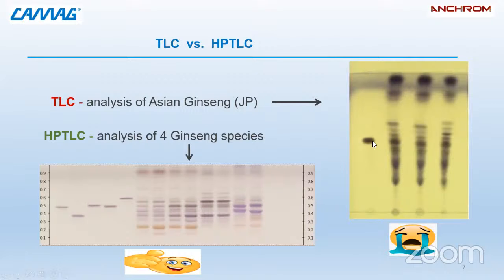Now, if I ask you whether this is the same as this, or whether it is present in the samples which are applied along with that, it would be difficult for you to conclude, because you can see that there is no proper separation. There is a lot of mass of unseparated compounds. It is difficult to identify whether this is the same as this.